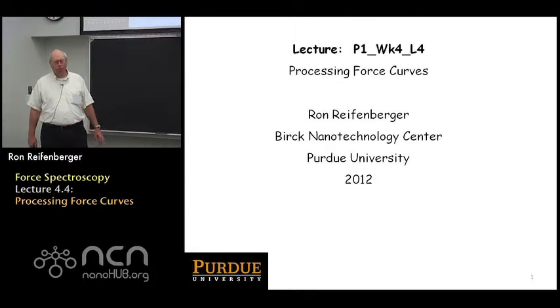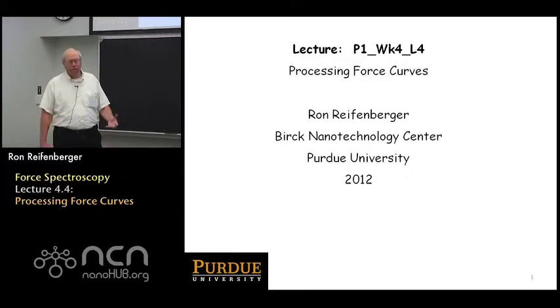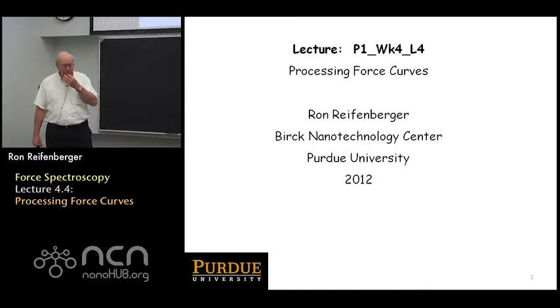This is the fourth lecture in week 4, and we're going to discuss how to process the force curves that you obtain when you do a force versus displacement experiment in an atomic force microscope.